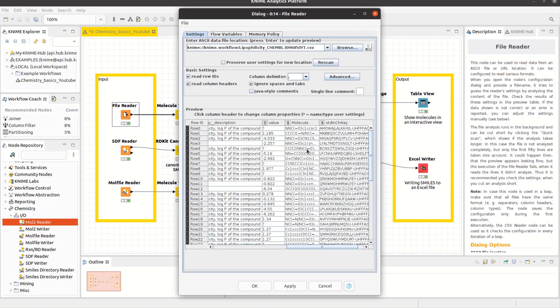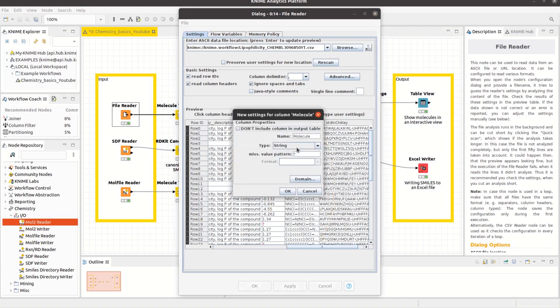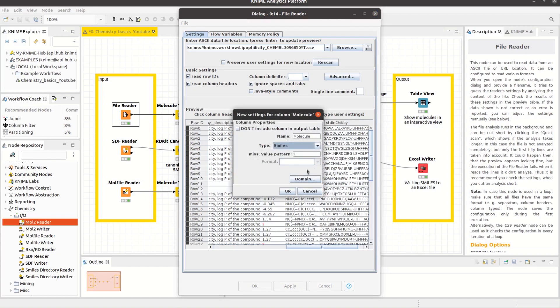The file reader guesses its settings by analyzing the file content. By default, columns of type SMILES are recognized as strings, but the column properties can be easily changed by clicking on the column header and selecting the type SMILES.